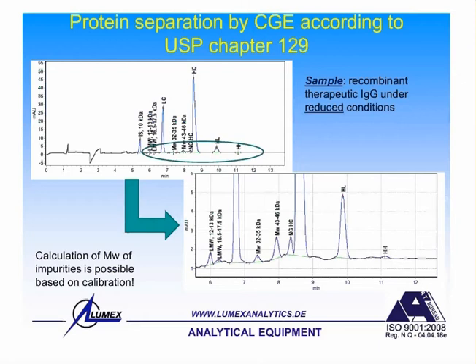If you spoil the capillary in capillary electrophoresis, first of all, you can easily wash it with certain solutions, first of all, with highly concentrated sodium hydroxide. But even if it is spoiled to the point that you cannot save it anymore, you simply throw it away and take another capillary.